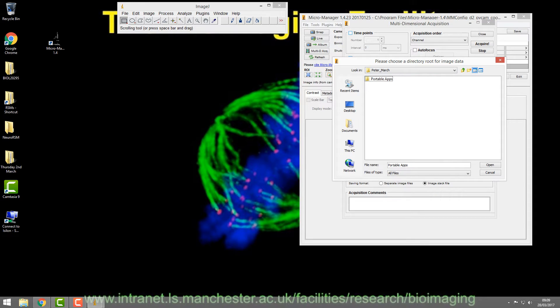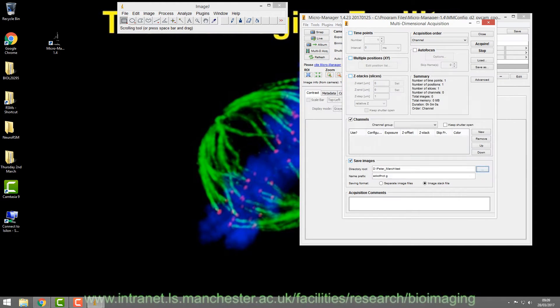Make yourself a folder — you can nest folders if you want. Create a new one, name it 'test', and that's the directory it will save to. Then give it a name like 'slide A positive'. Everything will then be named incrementally, so the first image will be 'slide_A_positive_1', then '_2', automatically saving as it goes along.